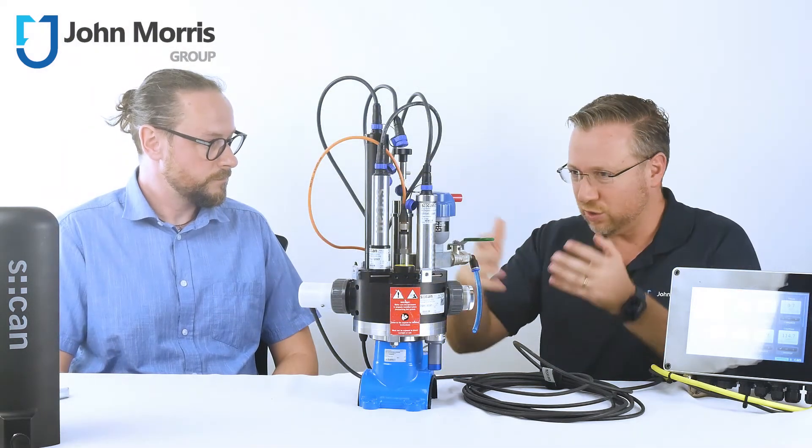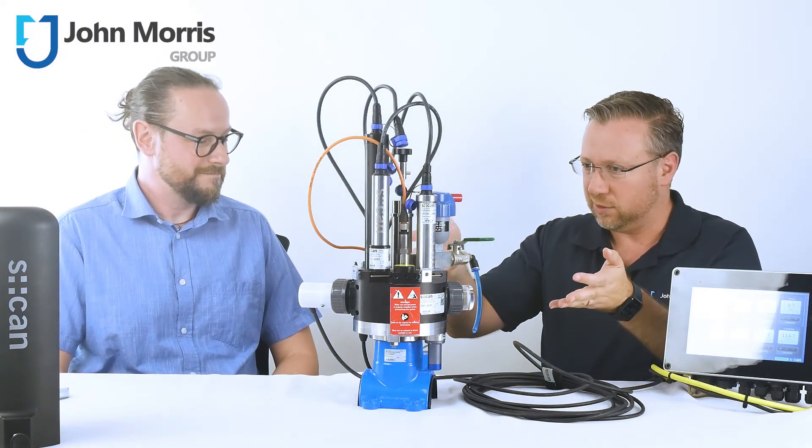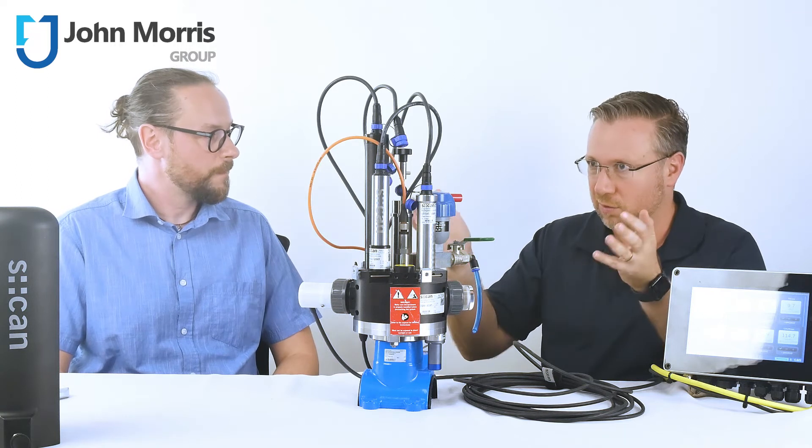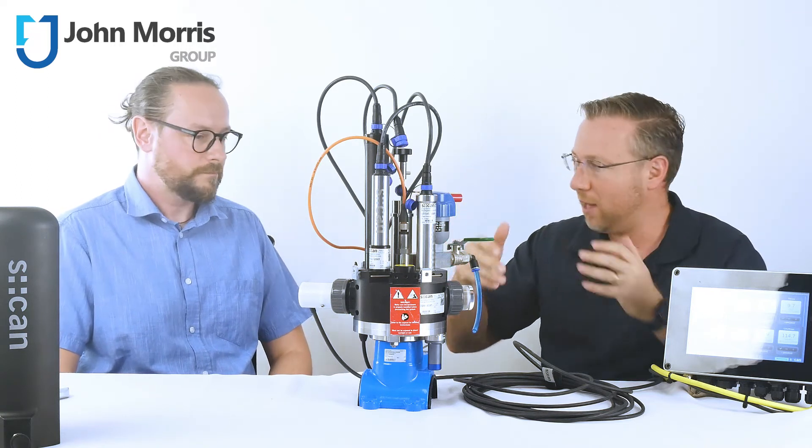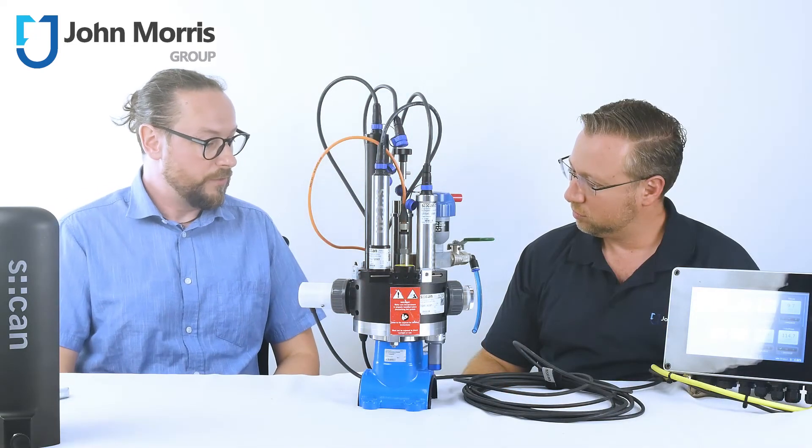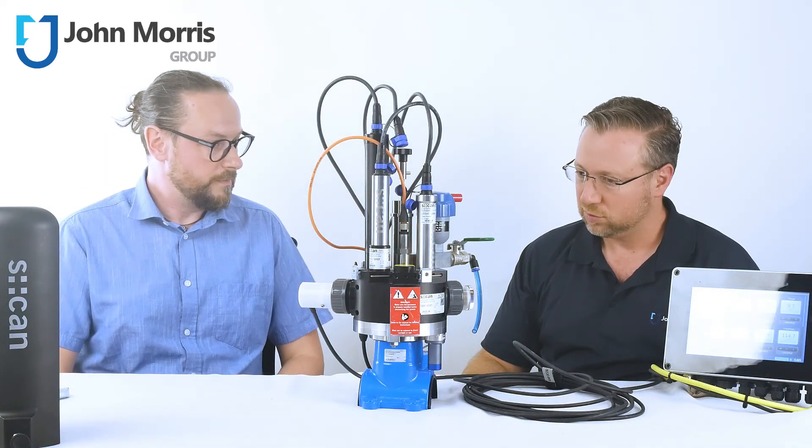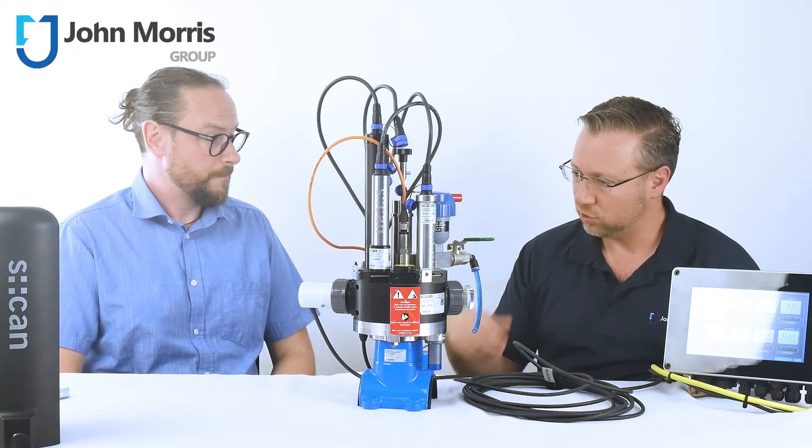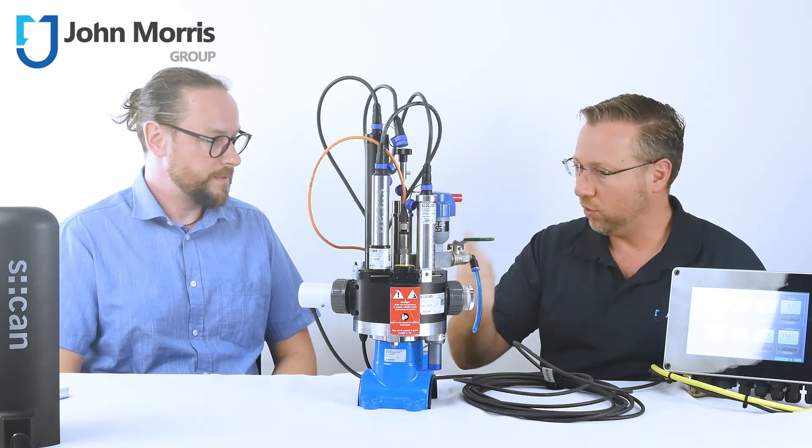Right. And where does the water go after it's been analyzed? And like it might, is there chemistry or what's going to happen? There's no chemistry, so it's only physical electrodes or optical. So the water passes the electrodes and no chemicals included. And the water which has been sucked into this flow cell goes back into the pipework after it passes the sensors. So basically no waste. No waste. No chemical contamination.